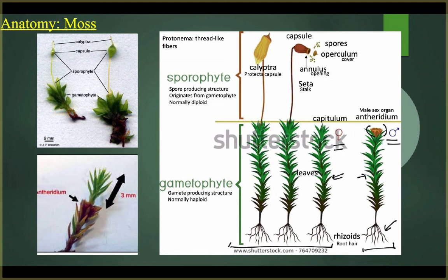Over here, you'll notice that the female is a little bit more complex because, of course, they have the gametophytes. We looked at the one in the male, and then you can see that this is the gametophyte for the female. These are the gamete-producing structures. This is what's going to produce the eggs and the sperm.